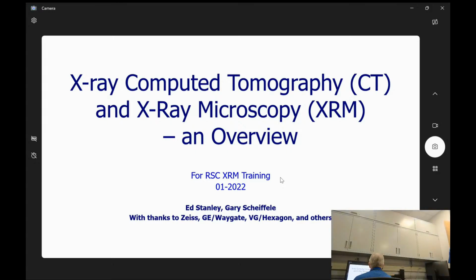Welcome to our Nano Day celebration at the Nanoscale Research Facility at the University of Florida. My name is Gary Scheifele, and I'm going to take you through what we can do with our X-ray tomography, specifically on our X-ray microscope, our Zeiss Versa 620.